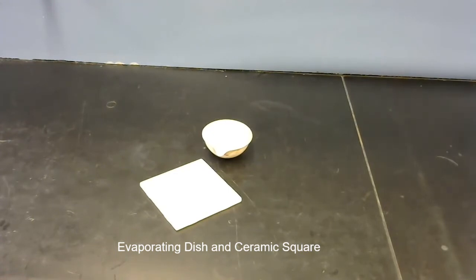The square there is just a ceramic tile, and you would use that to put something hot on it so that it wouldn't damage the counter.